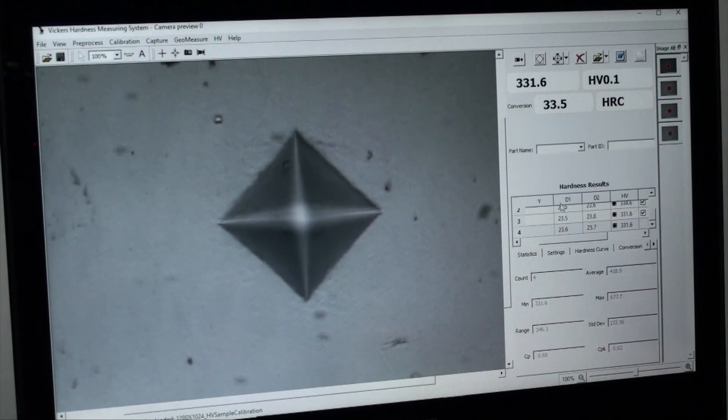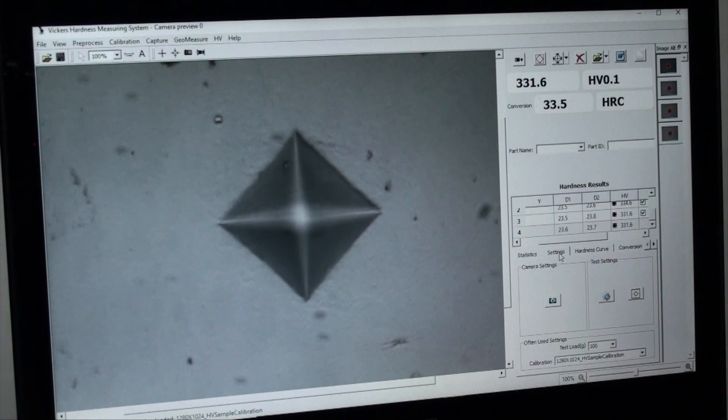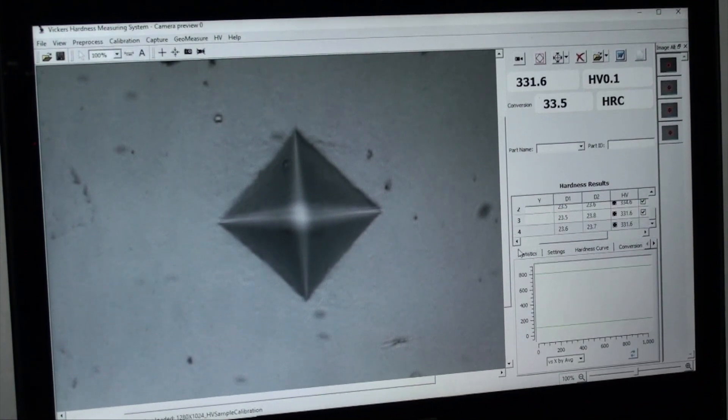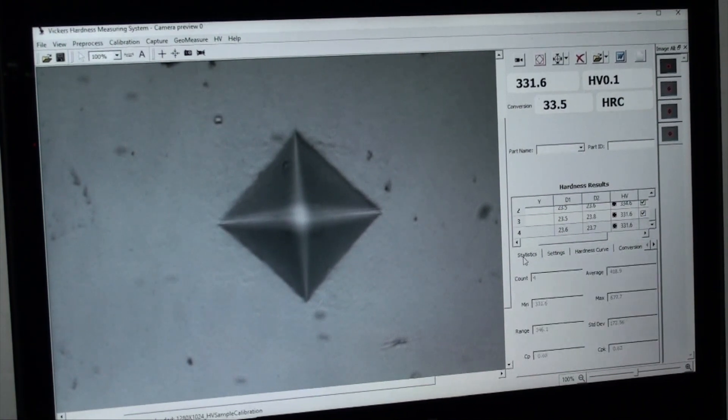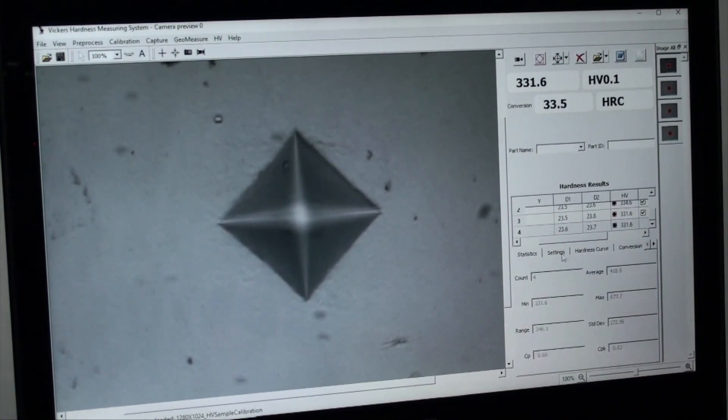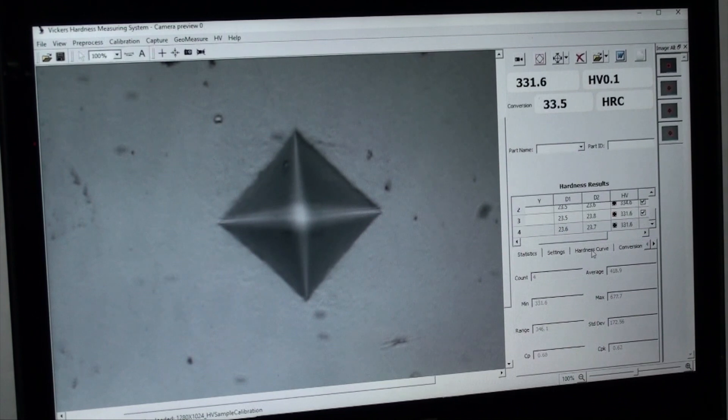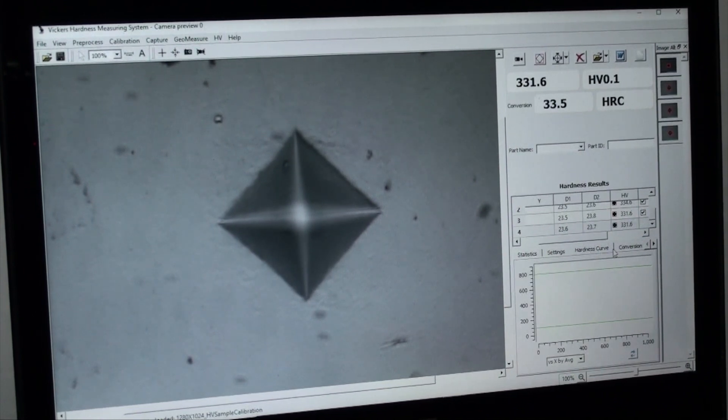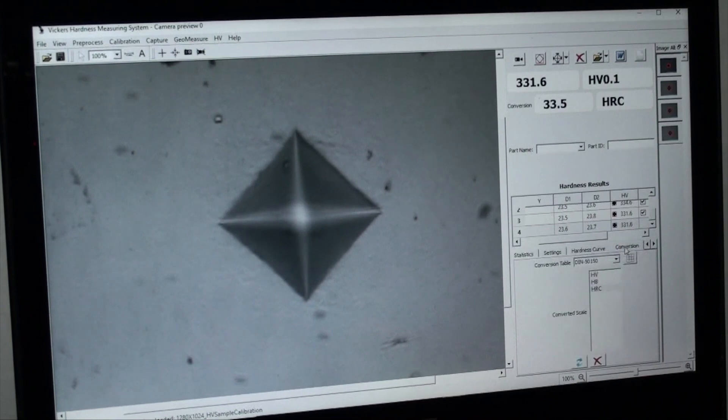Below that, we have settings and parameter changes on the fly in statistics, machine control, hardness curve, conversions, corrections, and other parameters.